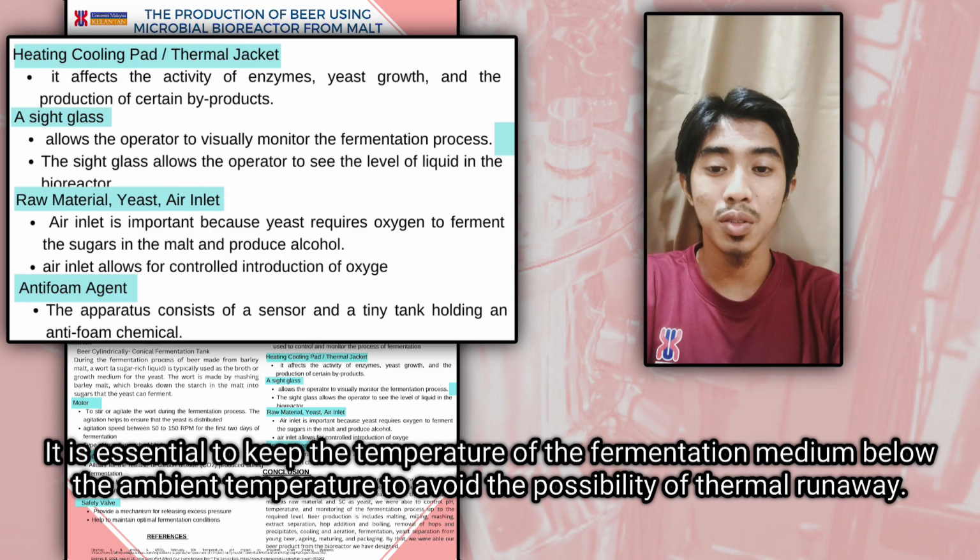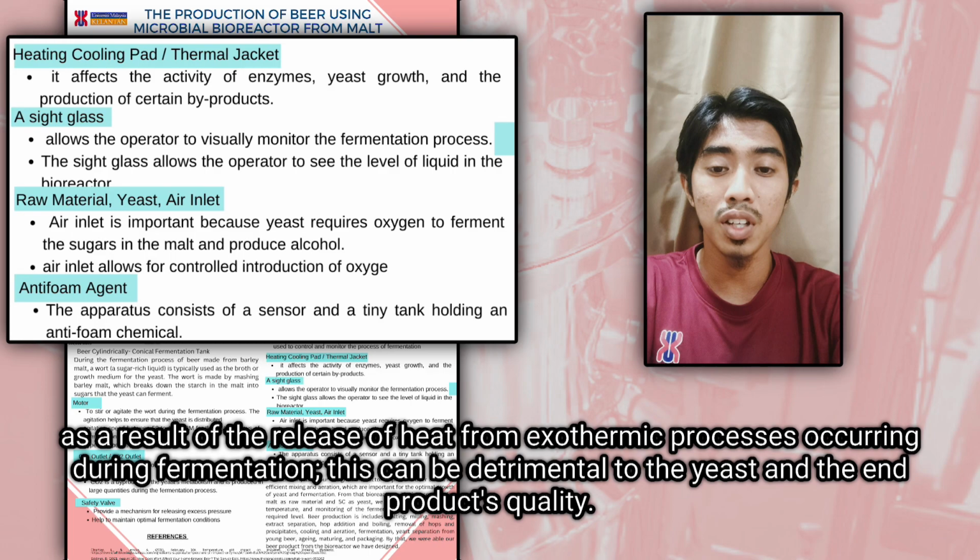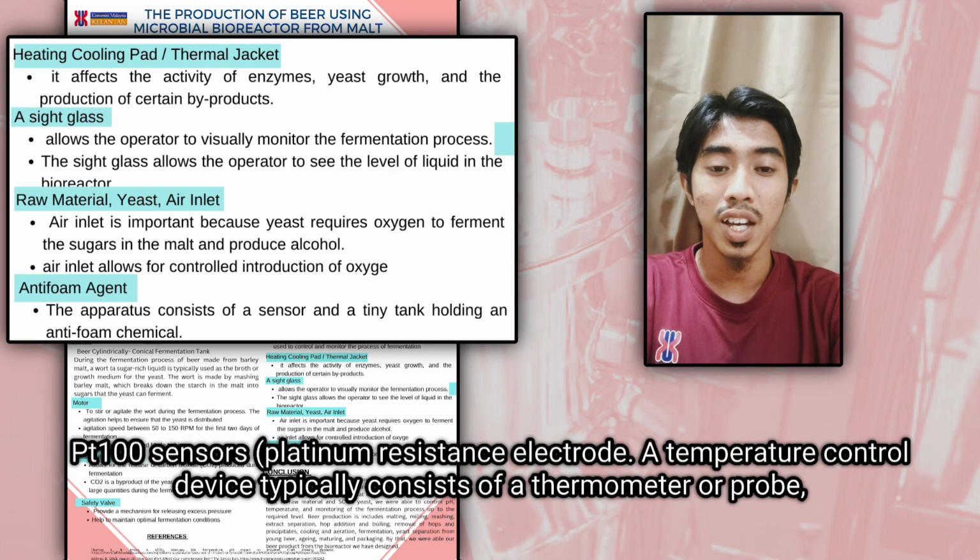It is essential to keep the temperature of the fermentation medium below the ambient temperature to avoid the possibility of thermal runaway. Thermal runaway is a phenomenon that occurs when the temperature of the fermentation medium climbs uncontrollably as a result of the release of heat from exothermic processes occurring during fermentation. This can be detrimental to the yeast and the end product's quality.